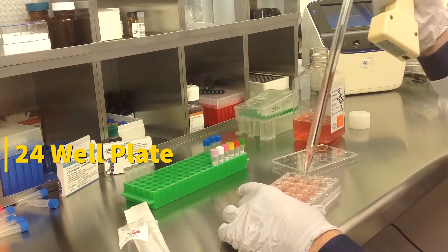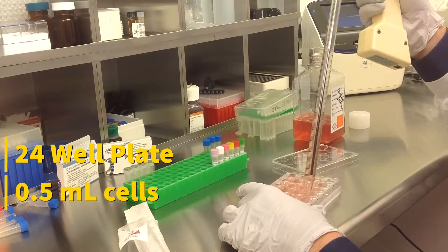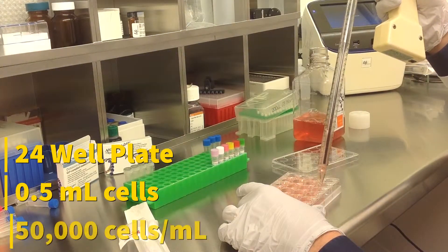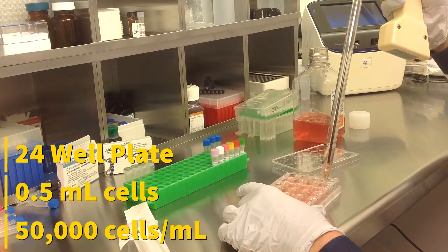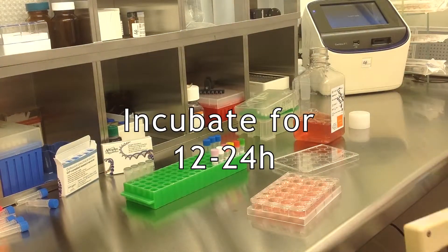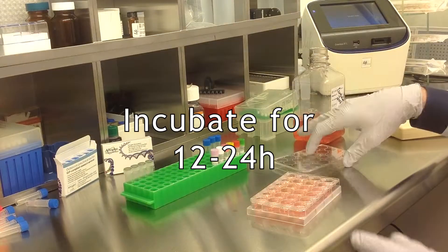Start by seeding 500 microliters of cells in complete growth medium into the wells. Cell density should be at 50,000 cells per milliliter. Incubate the cells for 12 to 24 hours before transfection at 37 degrees Celsius in a humidified carbon dioxide incubator.